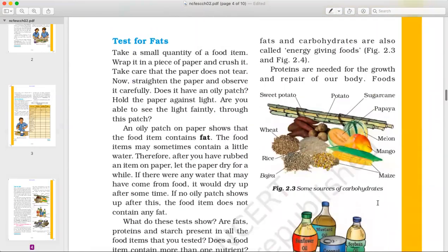Now we will see the test for fat. Take a small quantity of the food item. Wrap it with a piece of paper and crush it. Now straighten the paper and observe it carefully against the light. You will see if there is an oily patch on the paper.